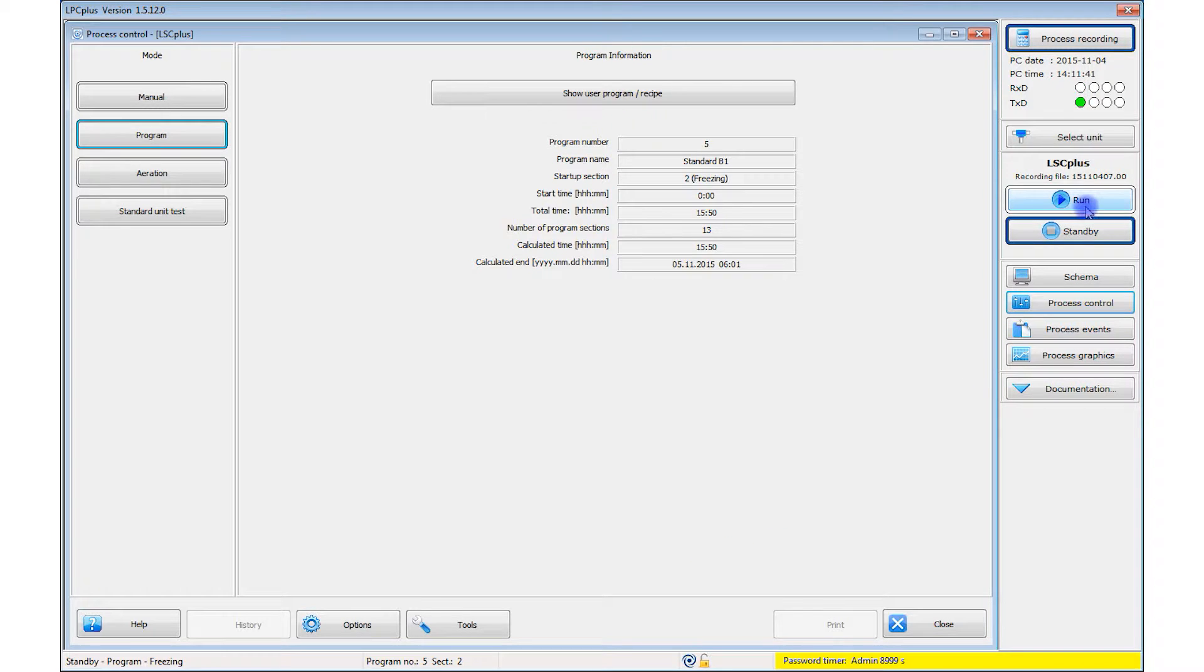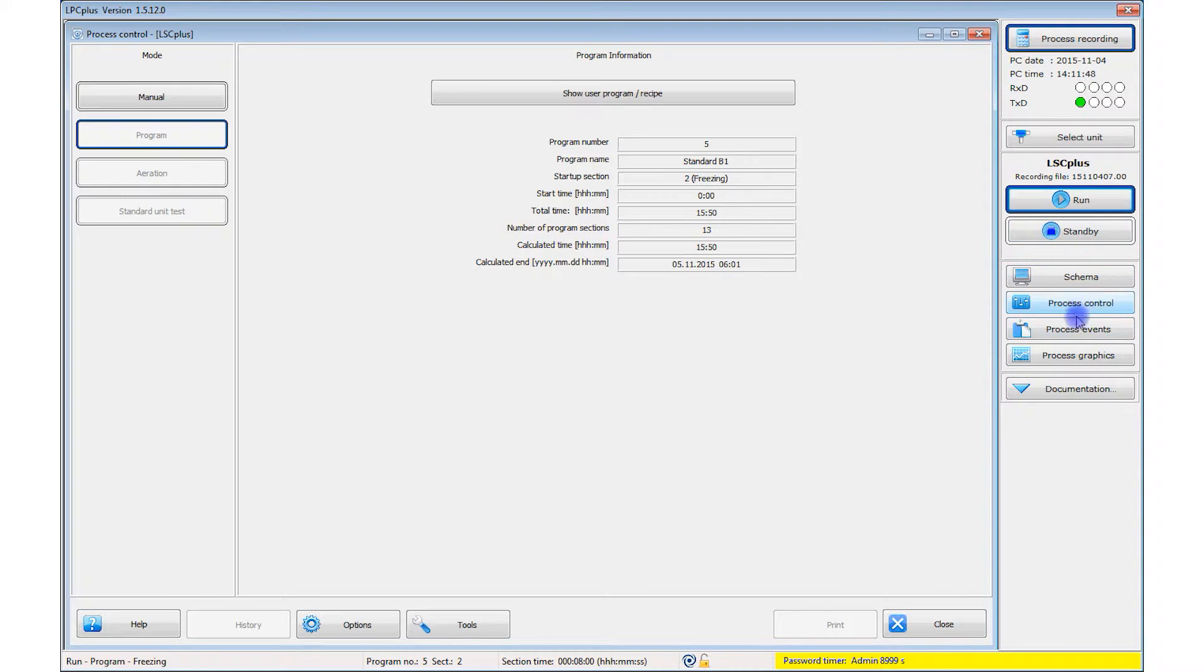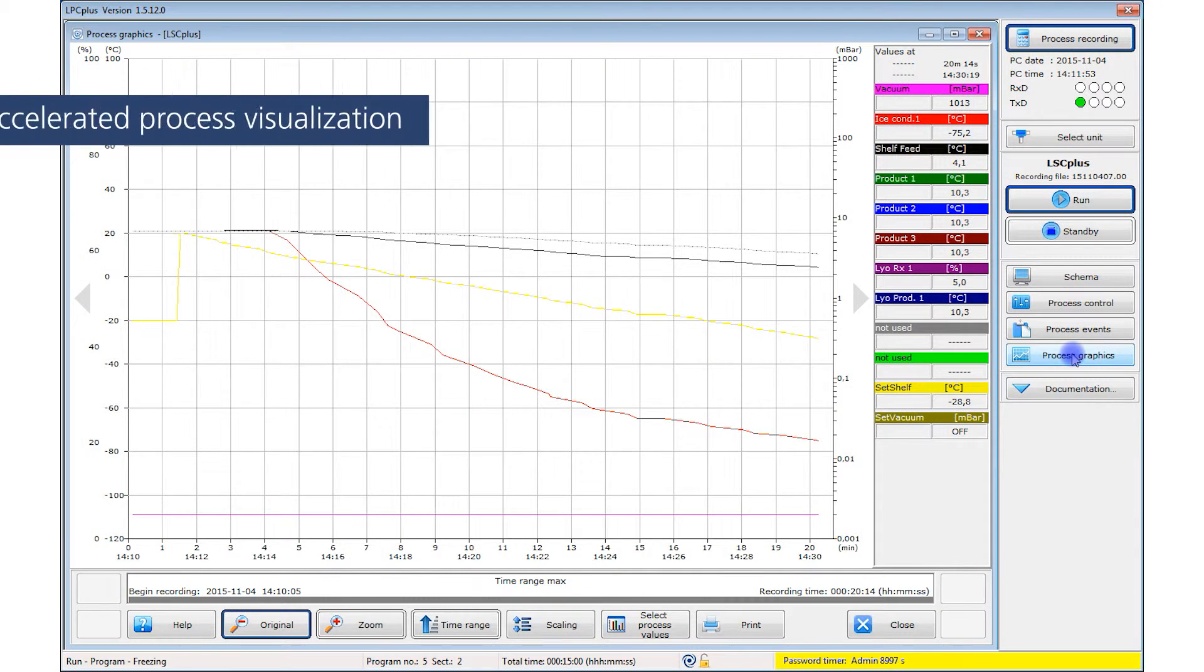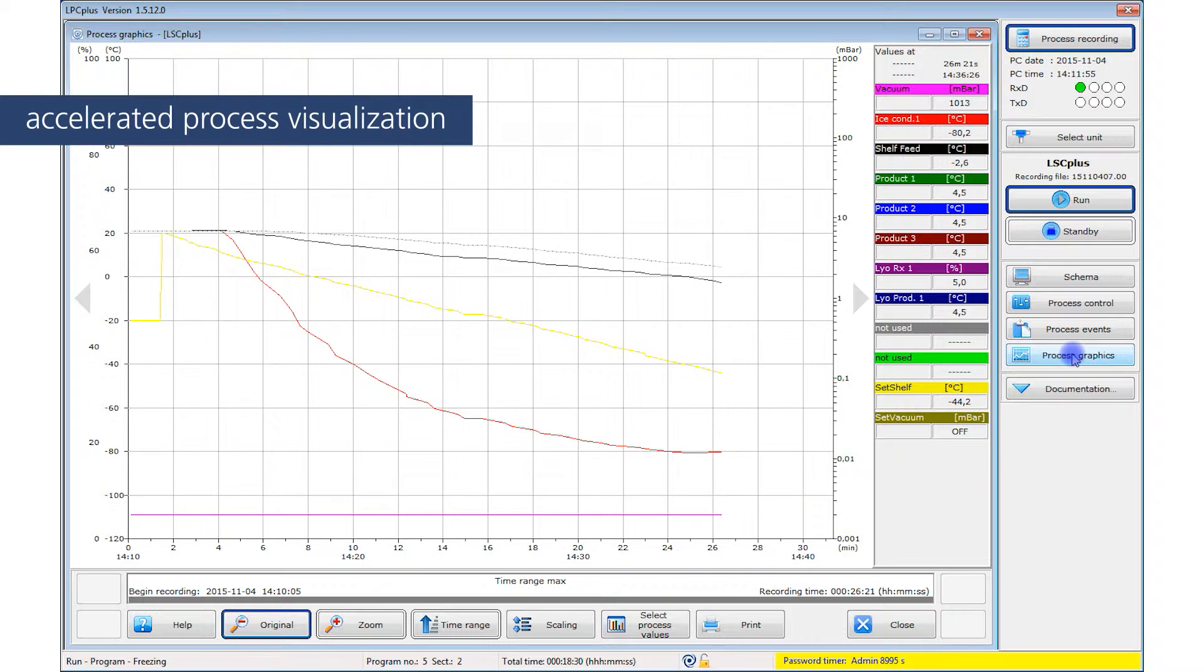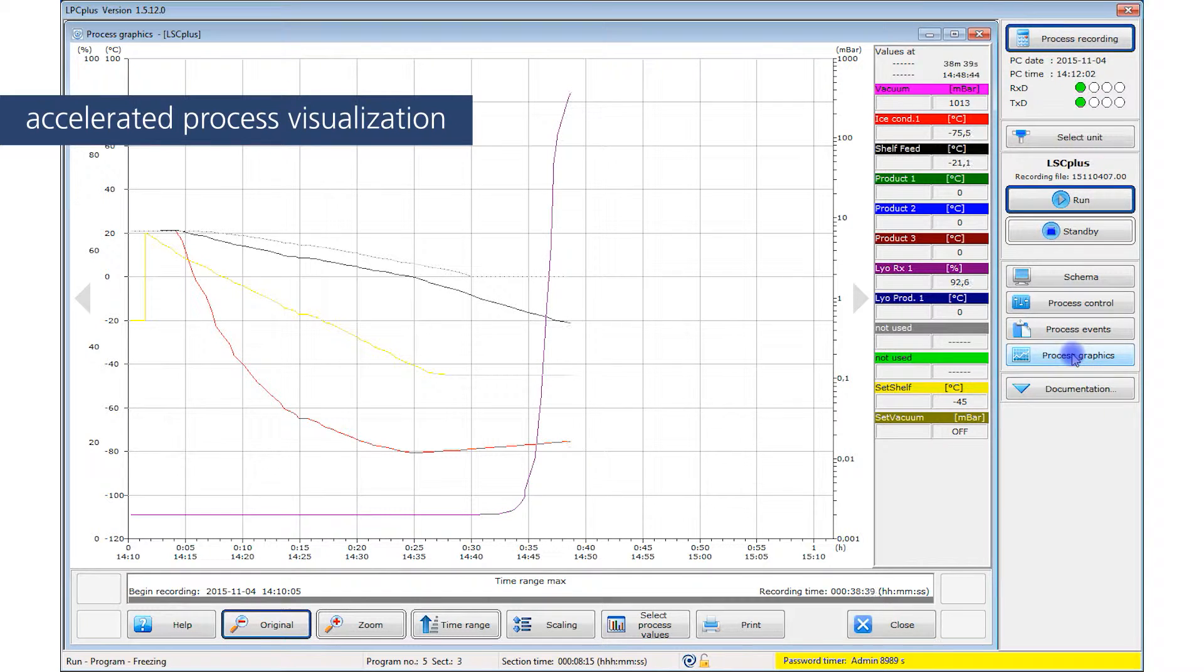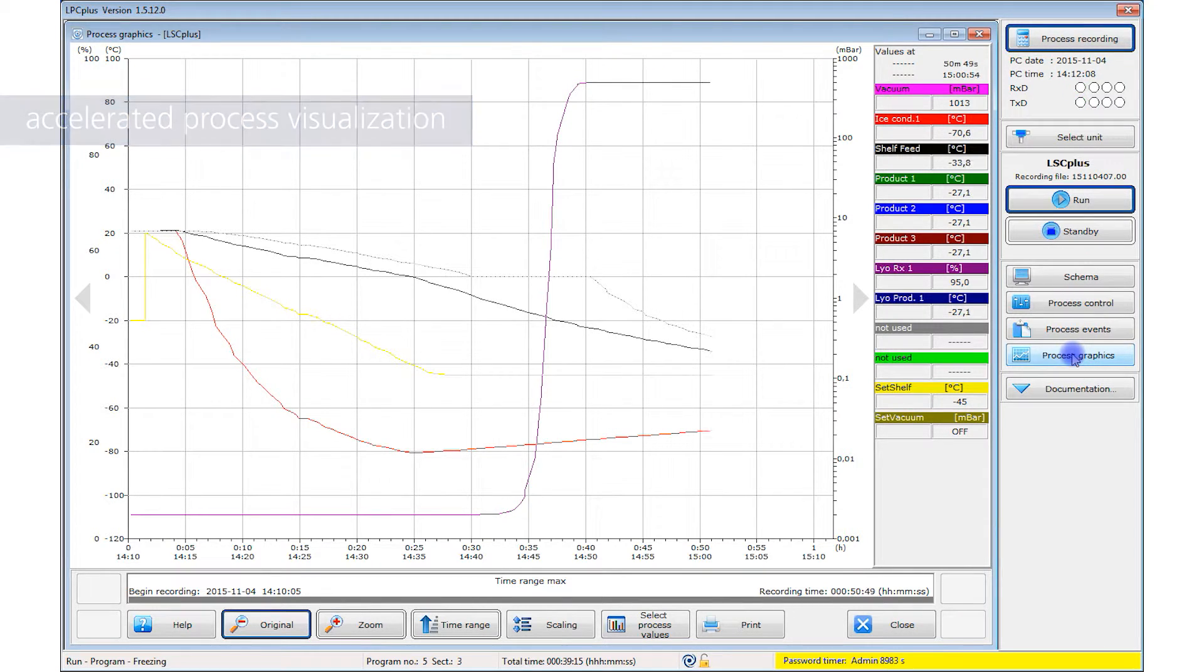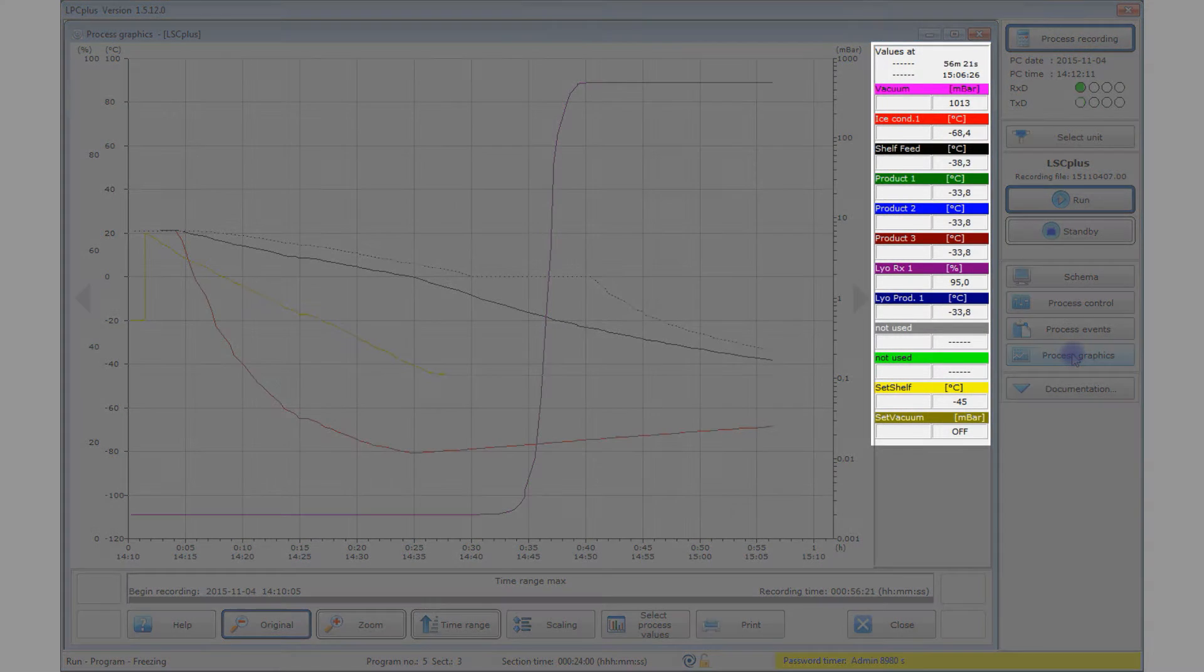The software LPC Plus records all process data from the start of the process until the process recording is stopped at the end of the freeze drying process. It is displayed in a process graphic, where you can view data during the course of the process, such as the vacuum level, the ice condenser temperature, or the product temperature.